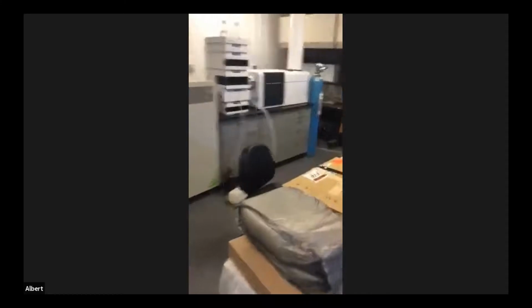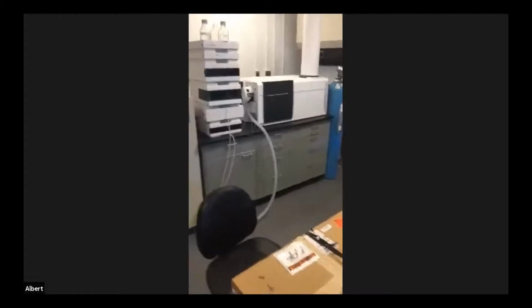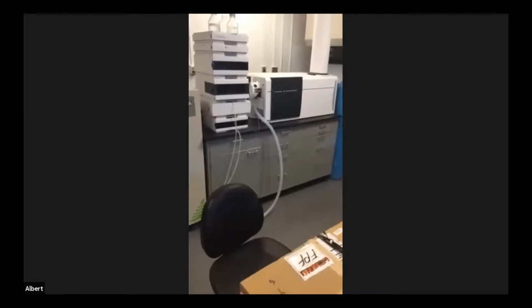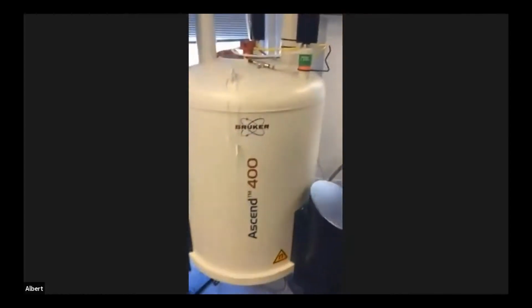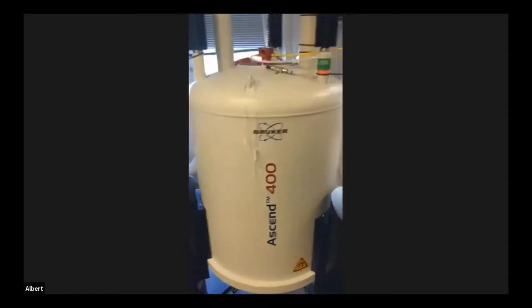All right, so sorry it took more than a minute. But this is the spectroscopy lab. It's Armstrong 101. Over here we have a mass spectrometer, a QTOF, LCMS, highly sensitive instrument worth about $750,000. And then this is our NMR spectrometer. It's a 400 megahertz, and it better not be out. It is a Bruker, 400 megahertz, and it is worth about $275,000.